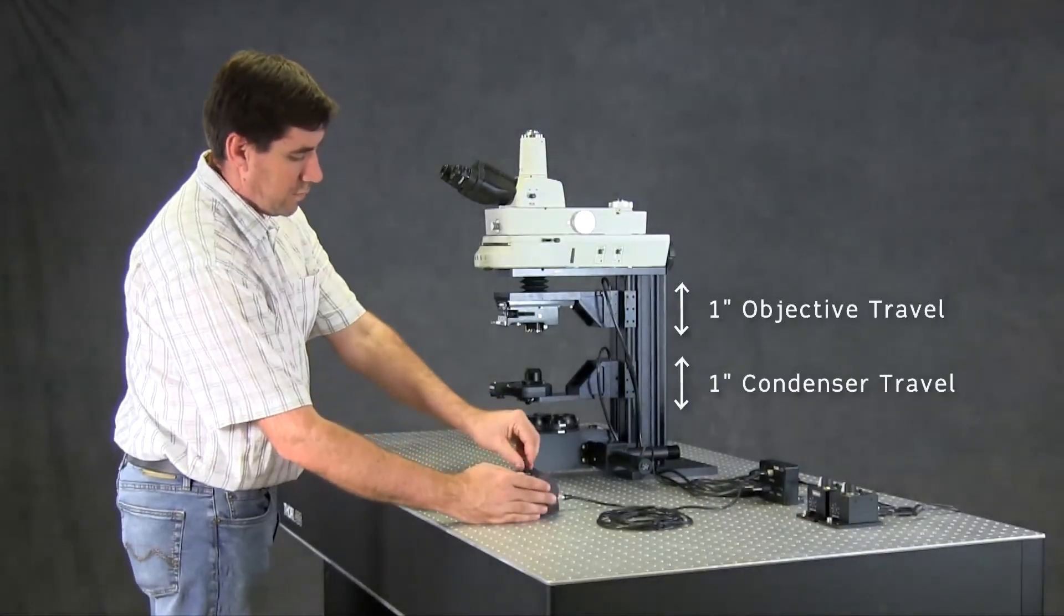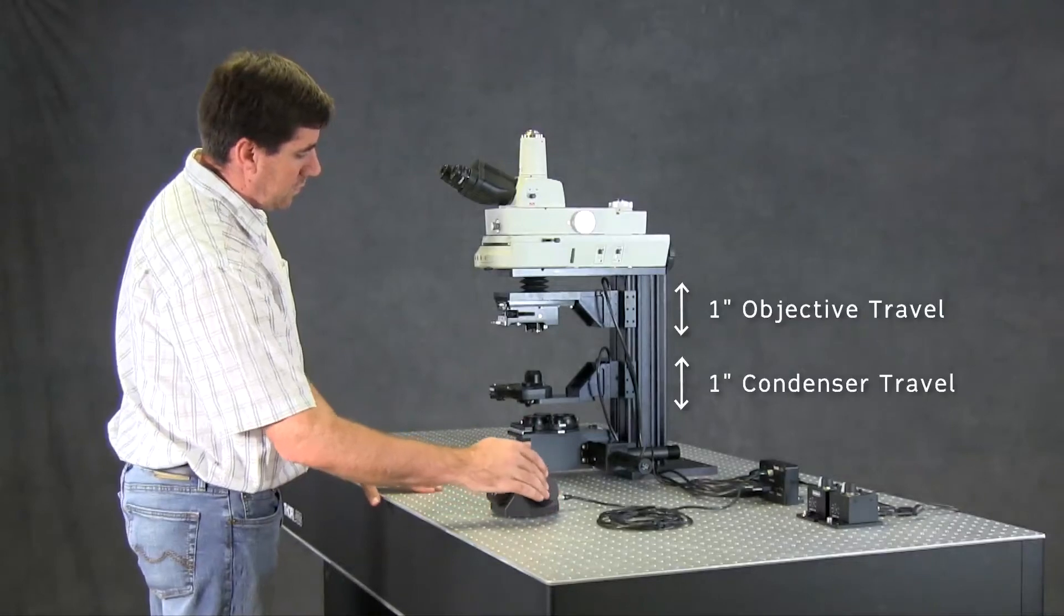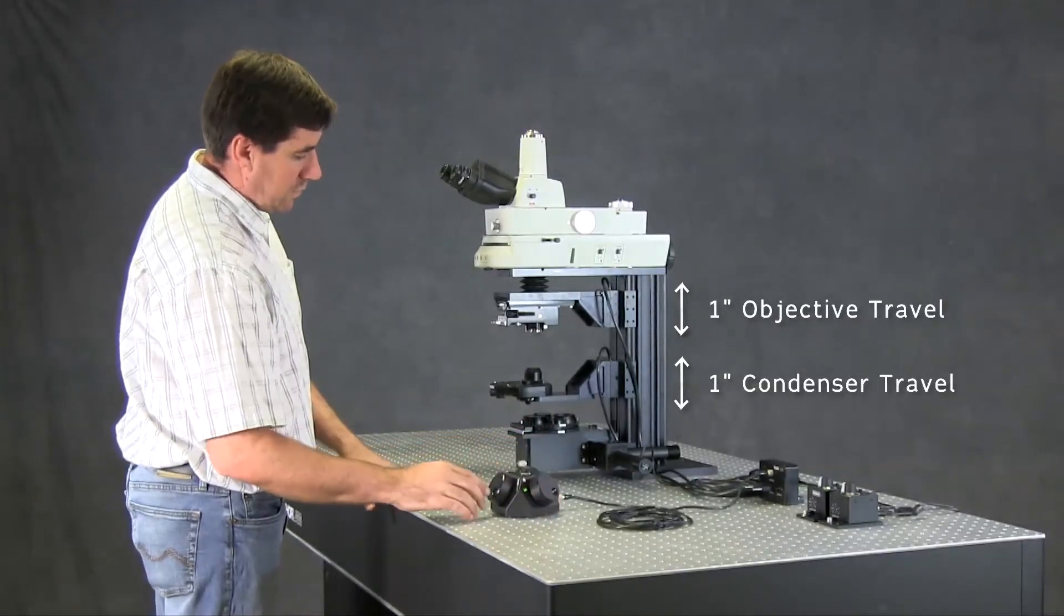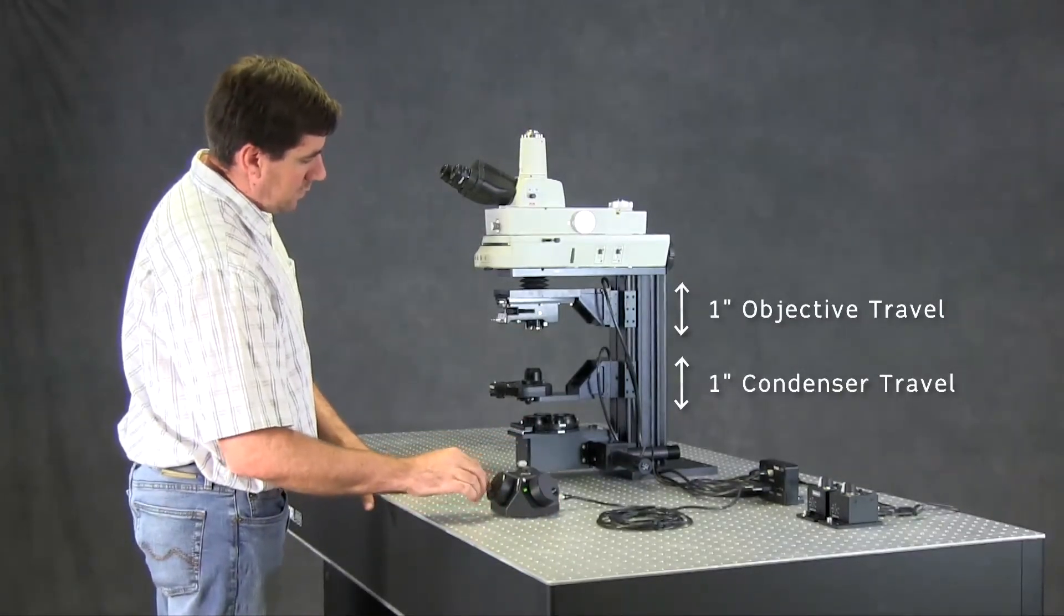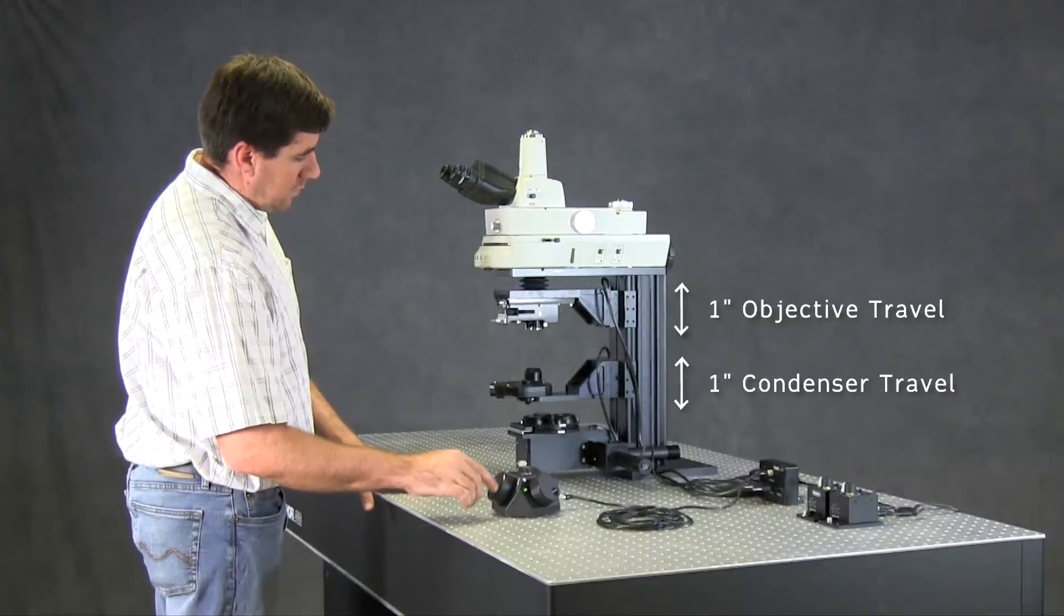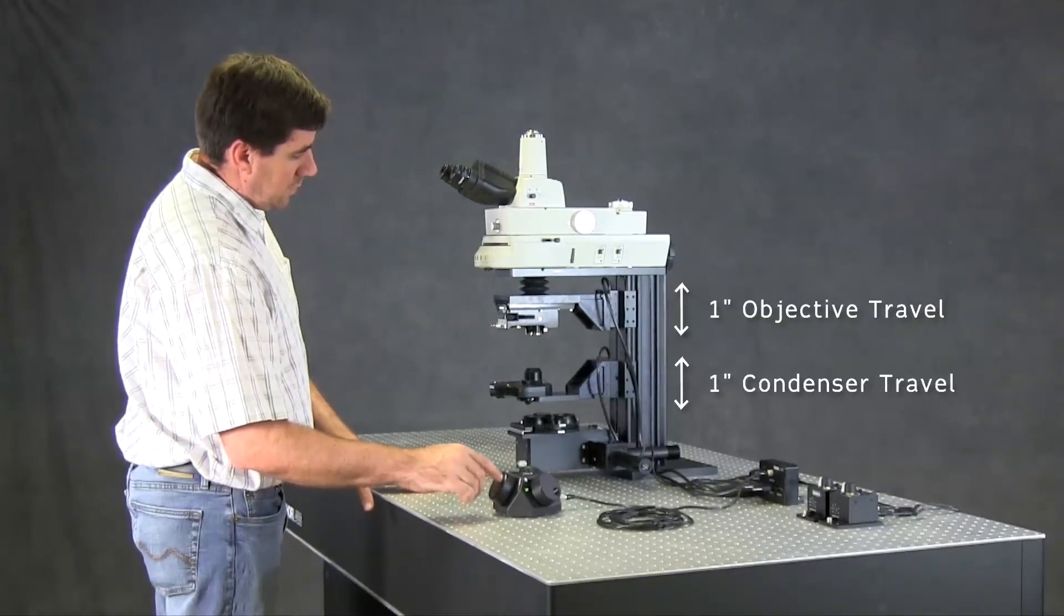The condenser and objective have one inch of fine motorized travel. The speed of the translation is user adjustable, supporting both slow, fine movements and fast, coarse movements.